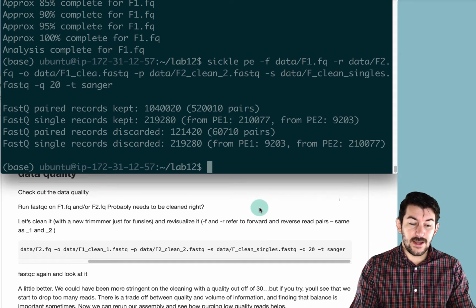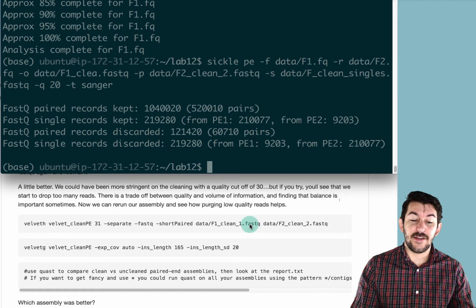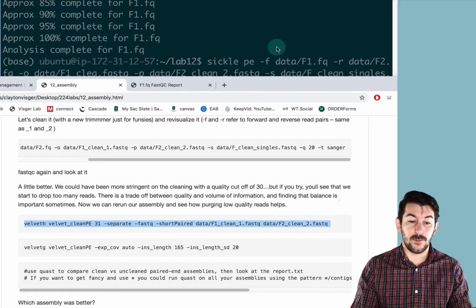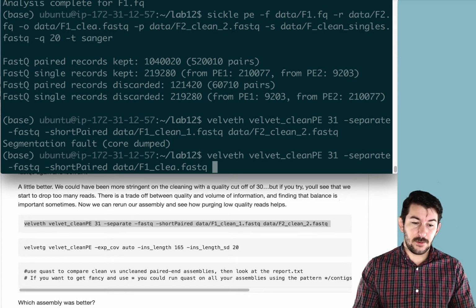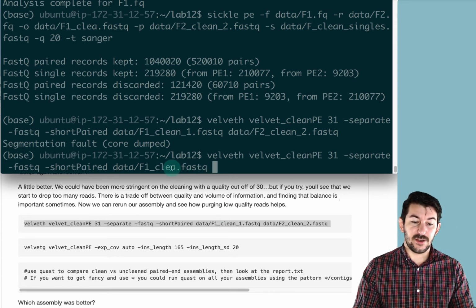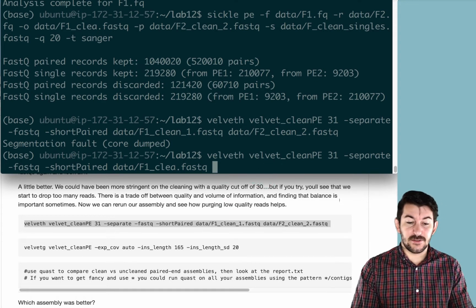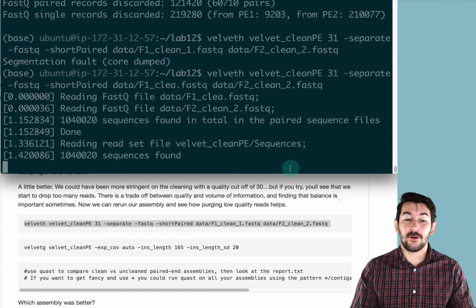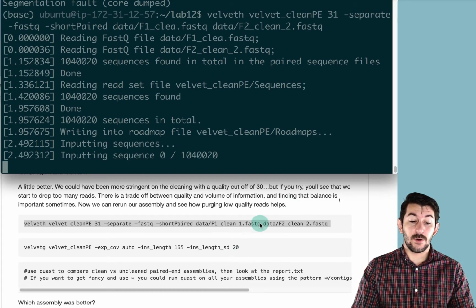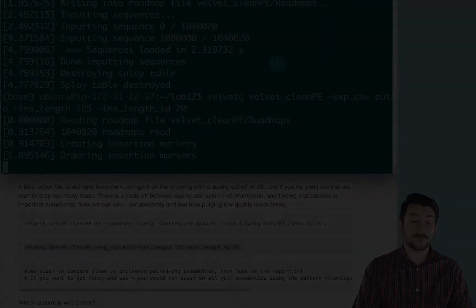So let's go ahead and use that to try and build a better assembly. Now, to expedite this, I'm going to start copying and pasting a little bit. We're going to rerun our assembly. You'll notice my names are a little different from below because I mistyped the output name for one of the things. It actually doesn't matter. I'll just adjust as I'm typing these out. And so we will hash these now cleaned reads, and then we will build a genome assembly from them.